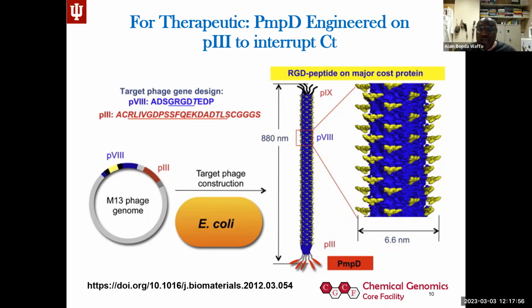If you have something in mind, or even some close sequence, I can go back to a story of one of the PIs. He has a motif that binds RNA, and he is thinking that by increasing some arginine in this motif, he can increase the contact with the RNA. And then I displayed this for the PI, and he is really happy with that.